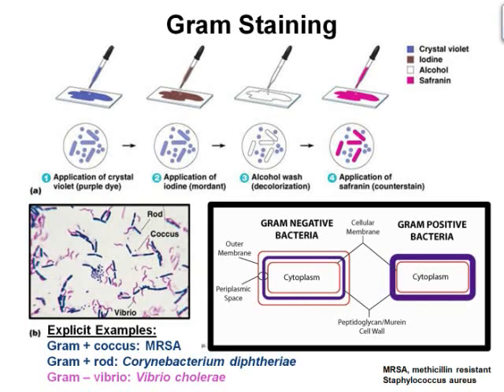However, it is important not to leave the alcohol on for too long, i.e. greater than 10 seconds, because it will penetrate the gram-positive cell wall and allow for the stain to escape, like the gram-negatives. Next, a counter stain called safranin is applied and the slide is rinsed and finally blotted dry. The gram-negative bacteria will absorb the safranin dye. These bacteria appear red under the oil immersion lens, while gram-positive bacteria appear blue or purple, reflecting the crystal violet retained during the washing step. This is shown in the lower left of the figure labeled B.